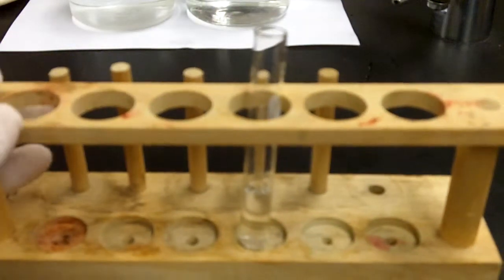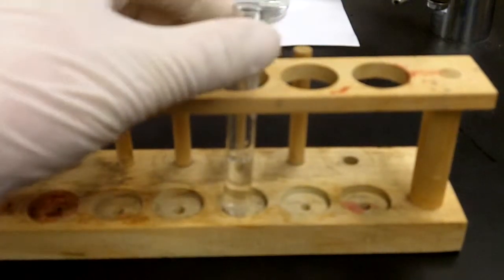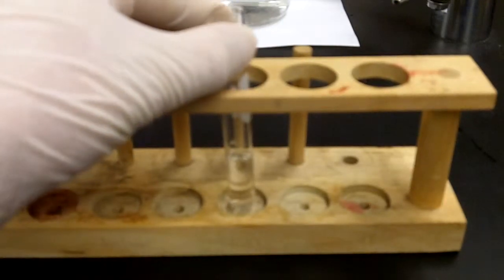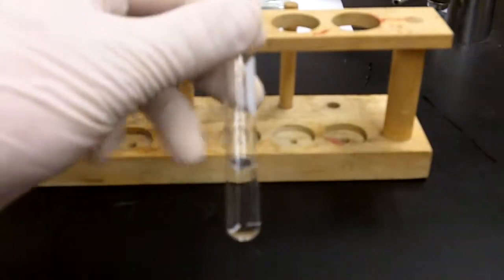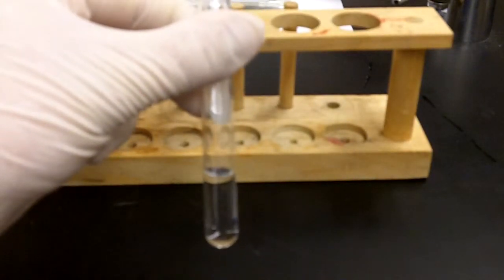Equilibrium B's equation we'll look at next. This one calls for a test tube with sodium chloride. So we have that here. And in this test tube of sodium chloride, we're going to add 12 molar hydrochloric acid, a few drops of it.